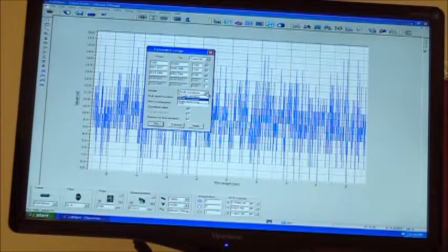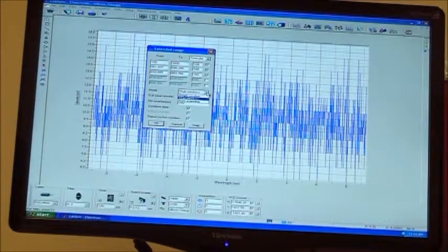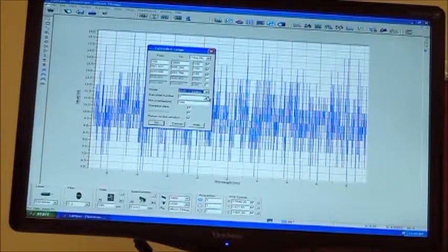So the multi-window, other than multi-window, is kind of a stitch and paste. The grating will move, it'll stop, then it takes an image. Then the grating moves to the next area, stops, takes an image. And then it just overlays the images to make it longer. Okay. We have another option that's auto scanning. Auto scanning is the continuous motion of the grating. So in the auto scanning mode, the CCD will acquire all the time and the grating will slowly move as it's acquiring, which will get you much better data, better resolution, and bring up some of those finer Raman peaks that might be escaping you.